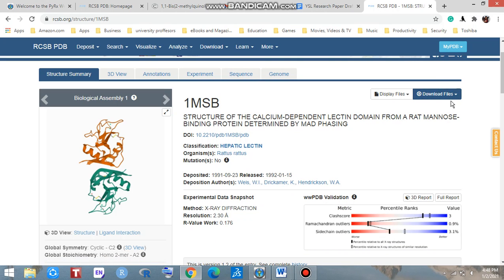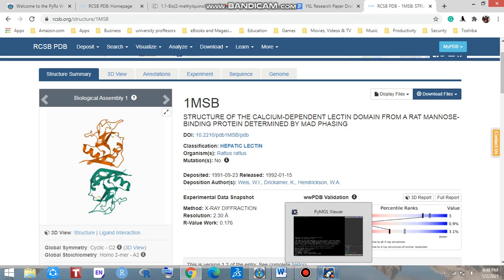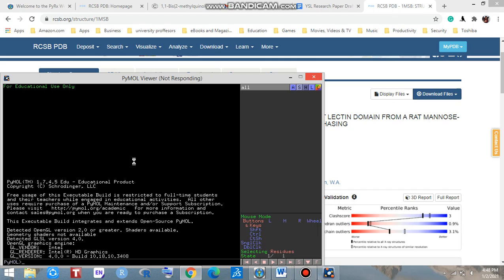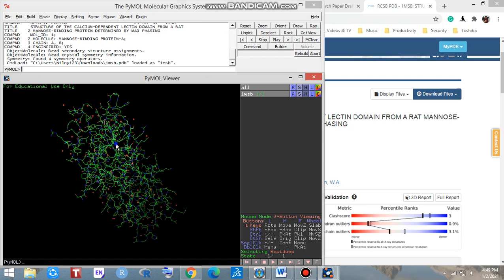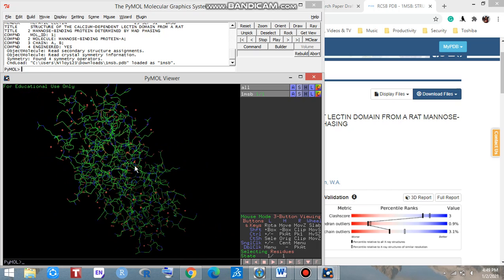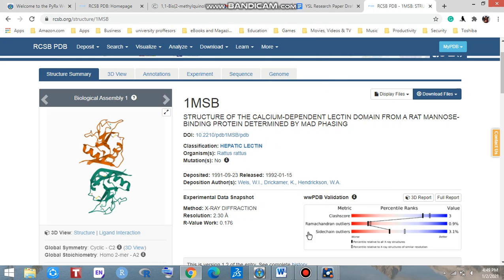If you have PyMOL, the visualizer, you can open it from here. My PyMOL is opening now and you can also view it from here. Look at that — this is the protein which we have downloaded. Okay, thank you very much, have a good day.